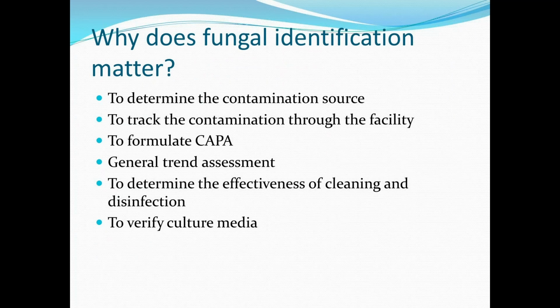Okay, so you may be asking the question, why go to this much effort? Does fungal identification matter? Well, it does to an extent, because even just on the basis that if 90% of clean room contamination is gram-positive cocci, staph and micrococci, then if fungi are found, it's something unusual, some odd event of concern, and therefore it's something worthy of examination. And knowing the identification allows the microbiologist to try and determine the contamination source.